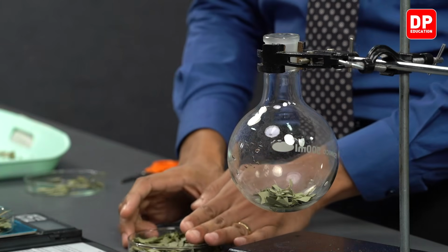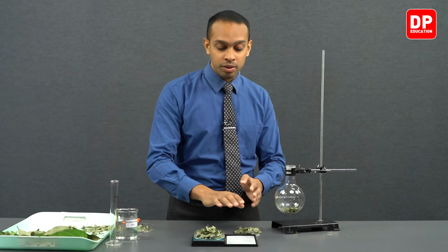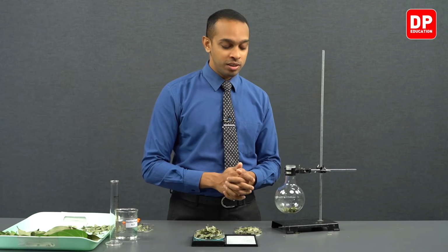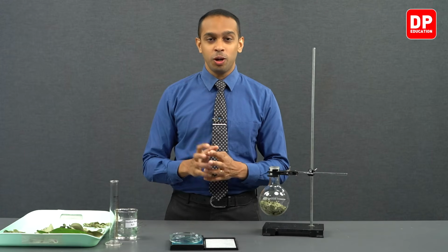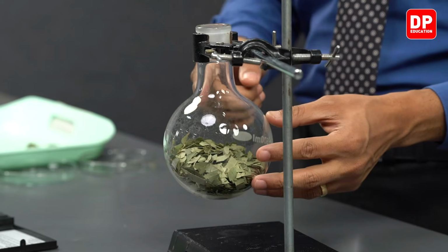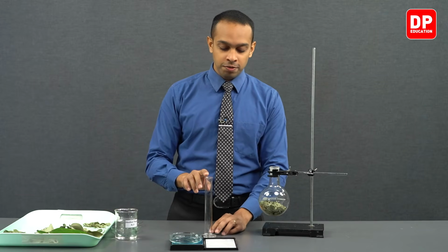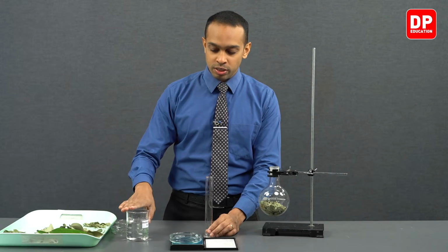So let's move on to completely filling this round bottom flask with the cut pieces of cinnamon leaves that we have measured here, and then we'll move on to the step of adding water to this round bottom flask. Now students, we have inserted all of our cut pieces of cinnamon leaves into our round bottom flask here. So let's add some water. We have our 50 milliliter measuring cylinder here, and we have some distilled water with us.